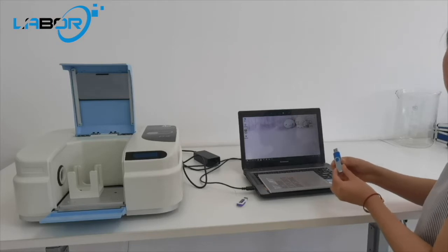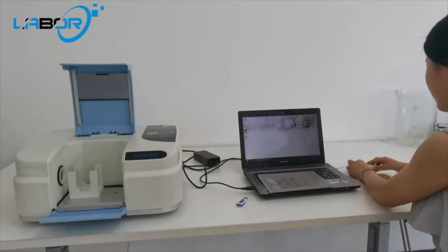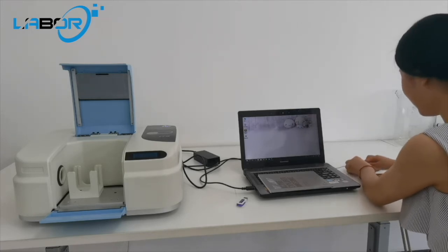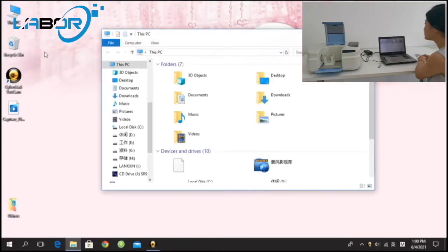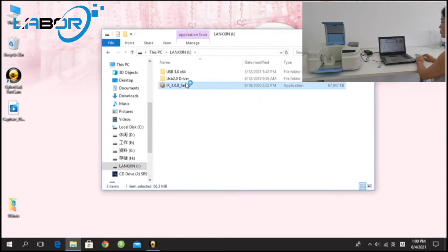Now it's okay. Please insert the software dock and software uDriver into the computer. Open the software uDriver. Install the software of FT-IR.